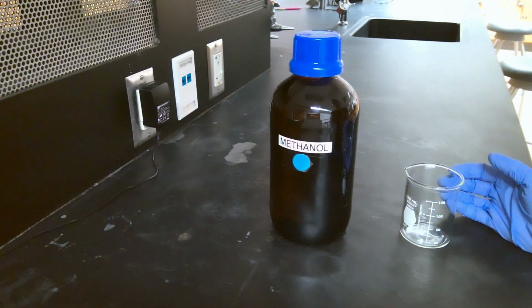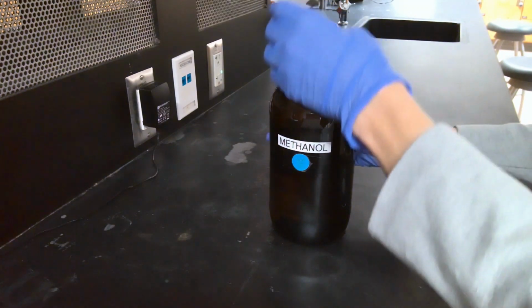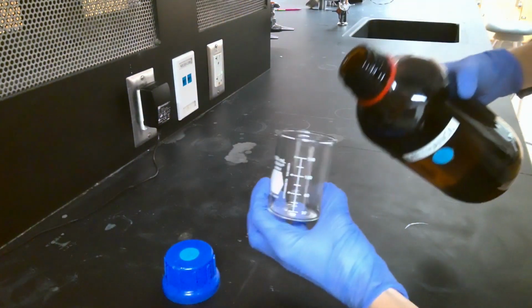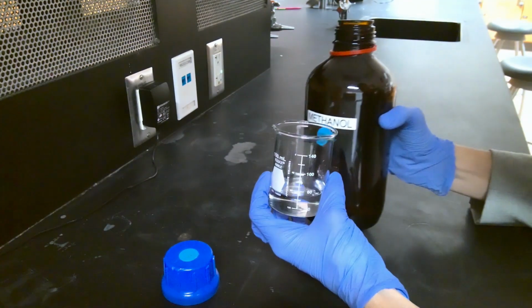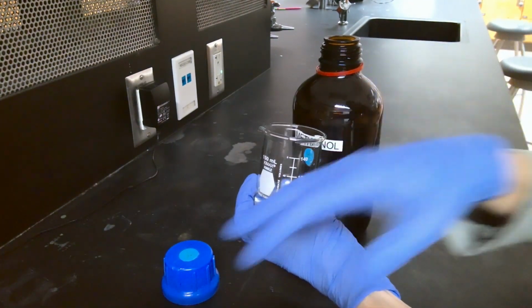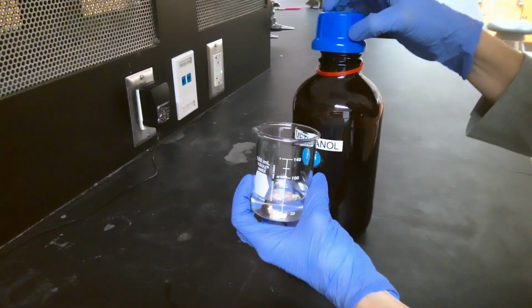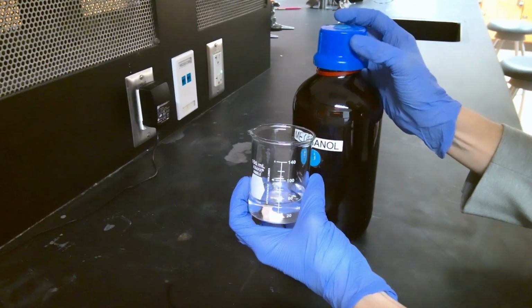The last compound that I want to talk about is methanol. We're going to be running our zinc iodide synthesis in a methanol solution. Methanol is a clear, colorless liquid. The primary concern when using methanol is its high flammability. It vaporizes very quickly, and both the vapor and the liquid form can catch on fire.